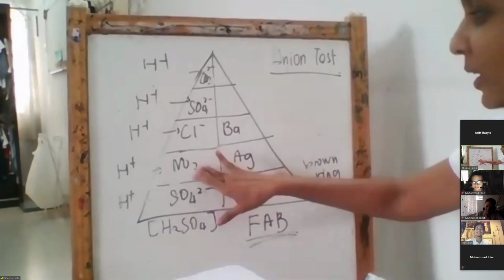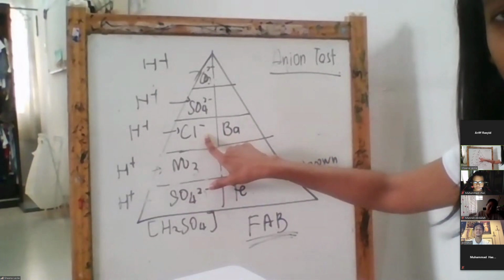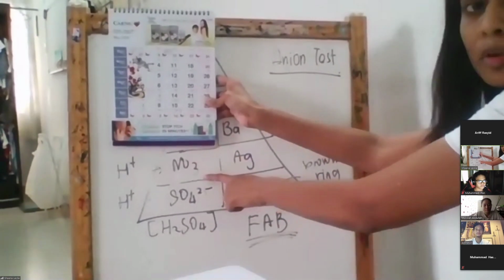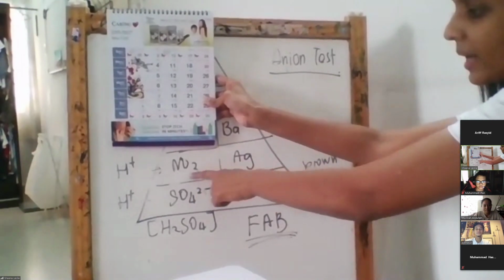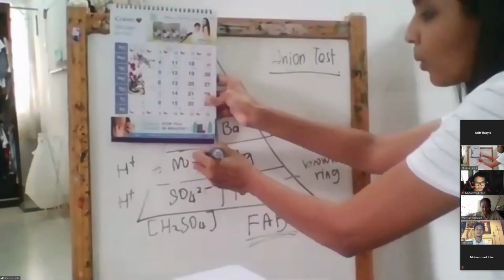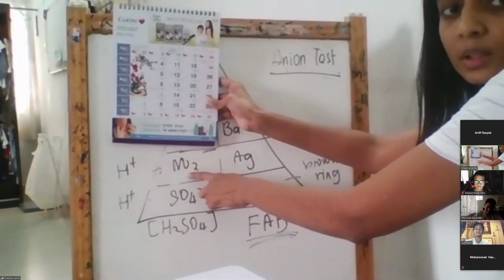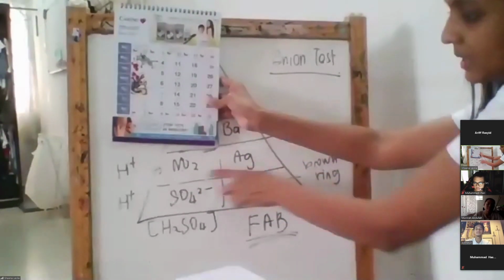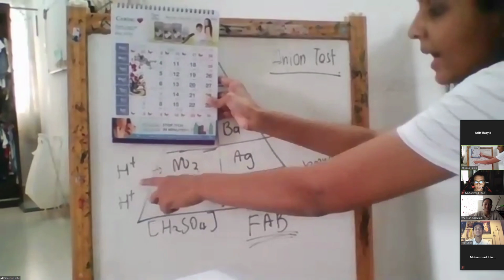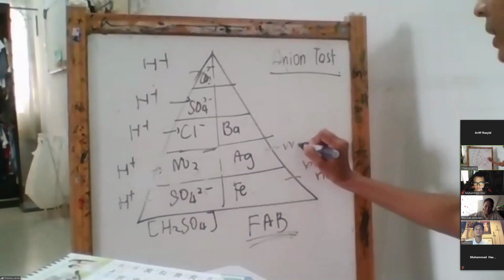Right, so I've done nitrate. Can I go on now? I want to test for chloride. Can teacher go on? Yes. Okay, so I want to test for chloride. I close chloride and I look at the bottom of chloride. What is at the bottom of chloride? Nitrate, isn't it? Yes. Okay, good. So what must I add? I must add nitric acid, correct or not? Yes. And then I must add what? Silver nitrate. Okay, I add nitric acid and silver nitrate. I am going to get a white precipitate.